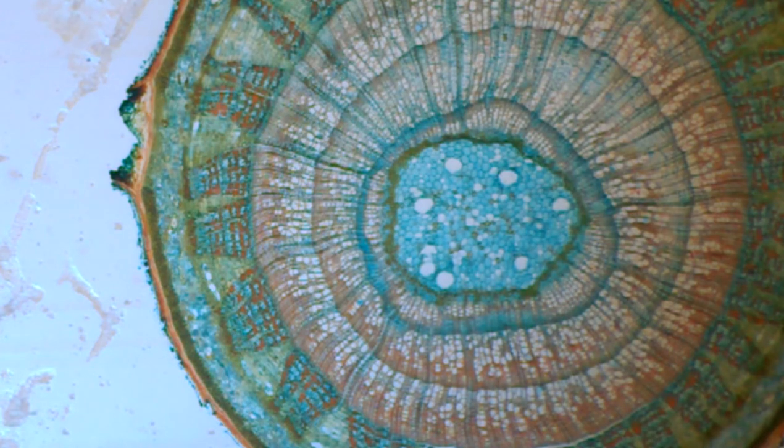And you can see the bark on the outside. Inside the bark is a little thin green layer of the cambium. And then you can see the growth rings and the phloem and the xylem.